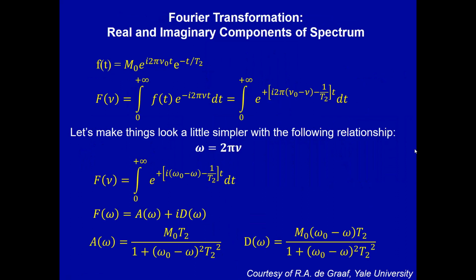Let's go back to the calculus form, the continuous function. Here is our sample function. The biggest we have is at the initial time, M0, that's the full net magnetization precessing in the xy plane. Here's the sinusoidal oscillation in case we are a little bit off resonance. If nu equals 0, you just see no oscillations. And now there is a relaxation, a transverse relaxation term.